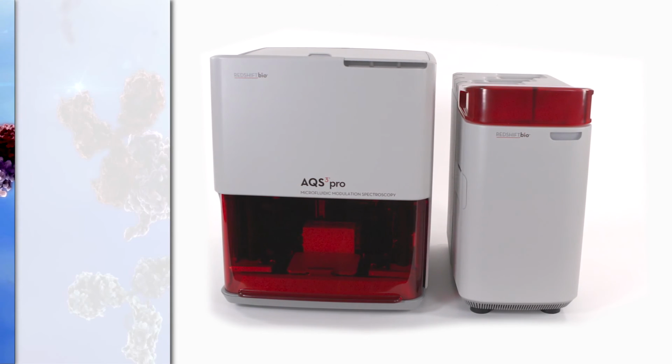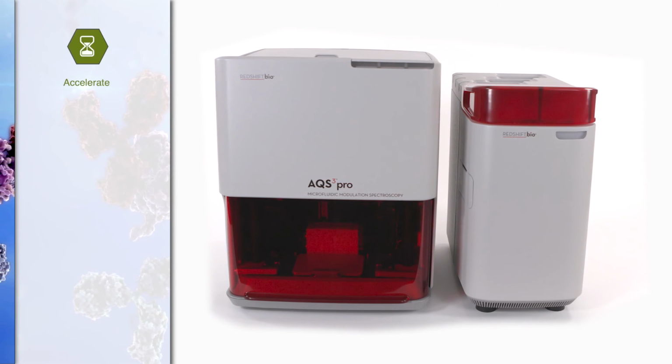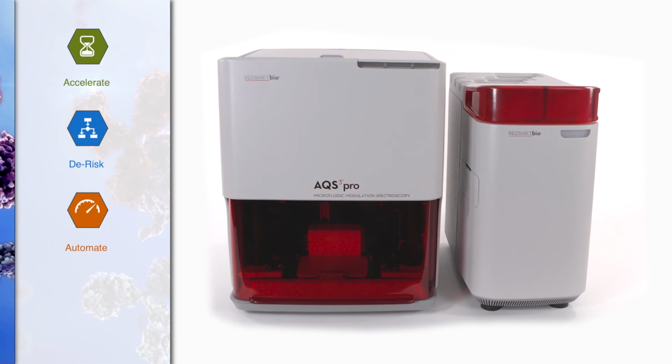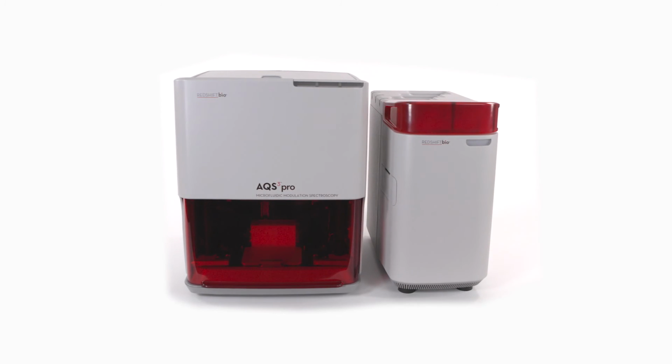Overall, the key benefits of the AQS3pro are that it can accelerate development by catching instability earlier in the drug development process, and the fully automated workflow saves time and money because we can load and run samples in a 24 or 96 well plate.